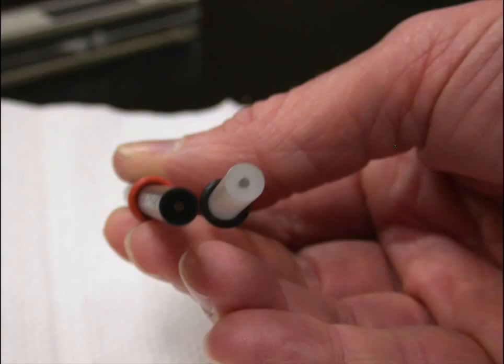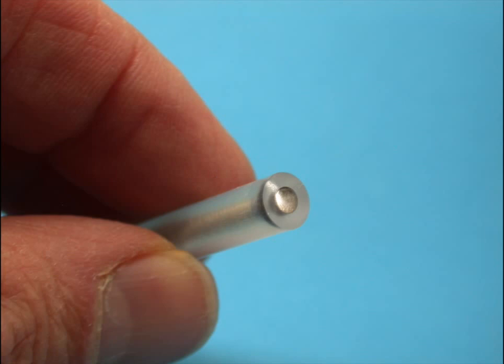Here we see a gold electrode on the left and a platinum electrode on the right. Graphite conducts well enough to make a good electrode, but there are some problems with its reproducibility.